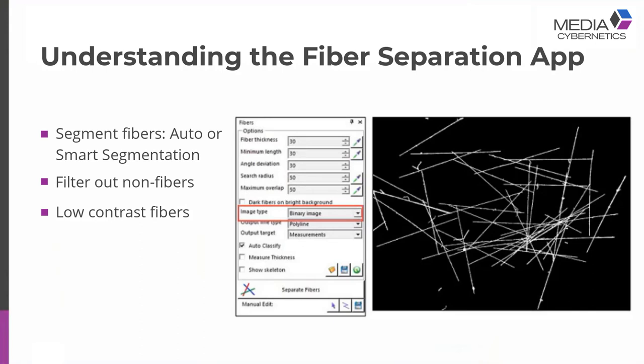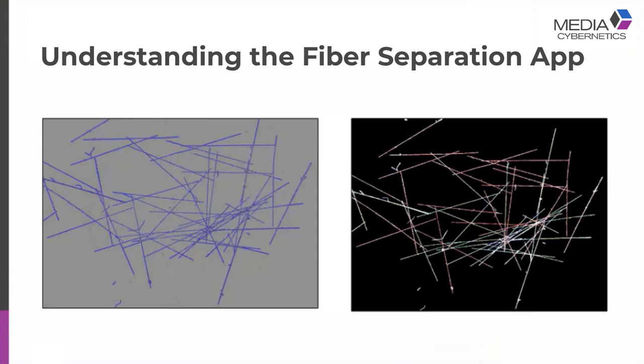The endpoint is to create a binary mask. I can count my image, create the mask in count size, and then use that as the input image type. In this case, all I did was use those parameters to create a binary mask, then run the fiber separation on the binary mask. After counting, I use Features Manager to confirm my results and transfer the outlines of my counted fibers back over to the original image to verify how well I was doing. It did a good job finding everything, and at that point it's easy to create a workflow to analyze your fibers.